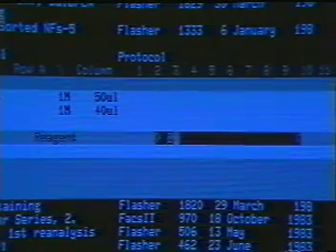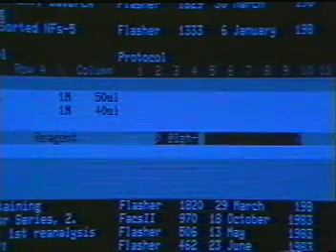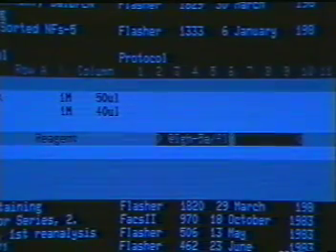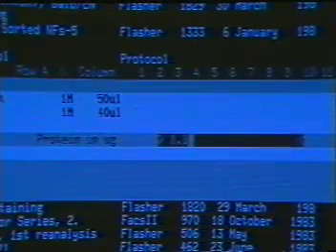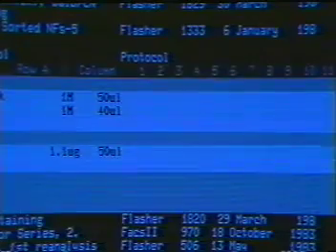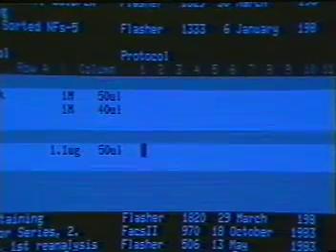The secretary recognizes the @ character as an abbreviation for anti. When you press return after answering the third prompt, the staining reagent appears on a pipetting line below the sensor heading.